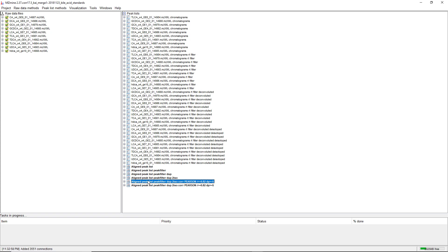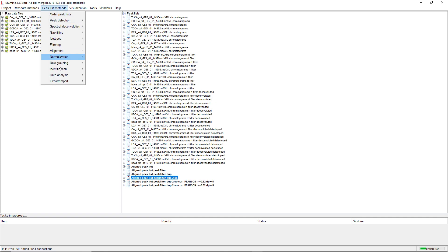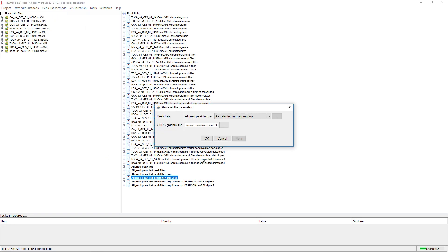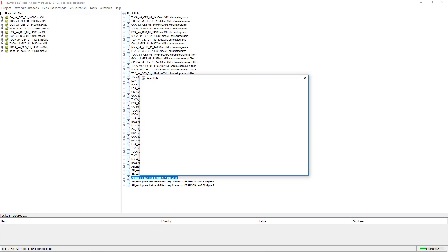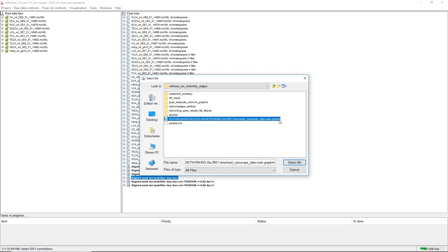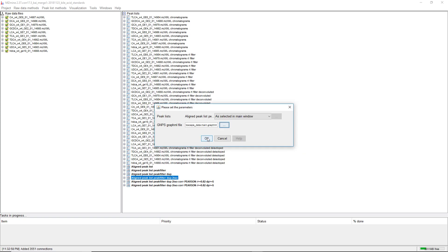If we want to import the results into MZmine, we can click on any of the lists, then Identification, Import GNPS Results. Here we can go into the folder — the one without IonIdentityEdges — and then click on the GraphML file with the results and click OK.